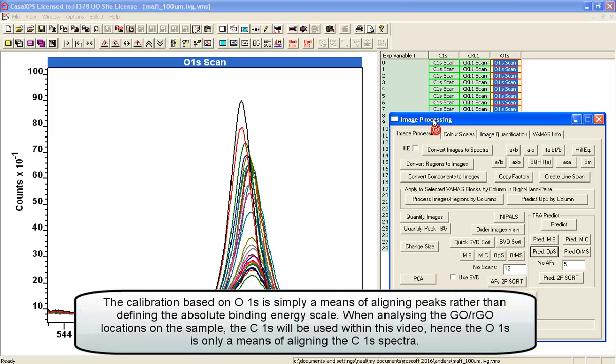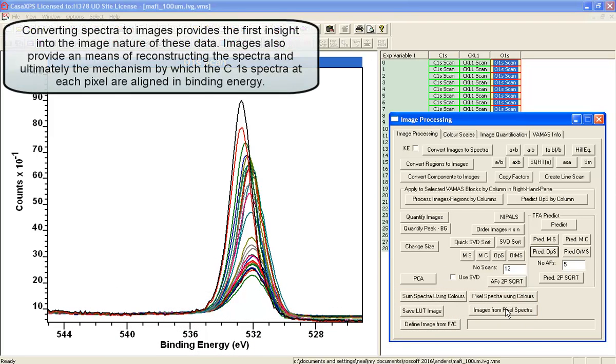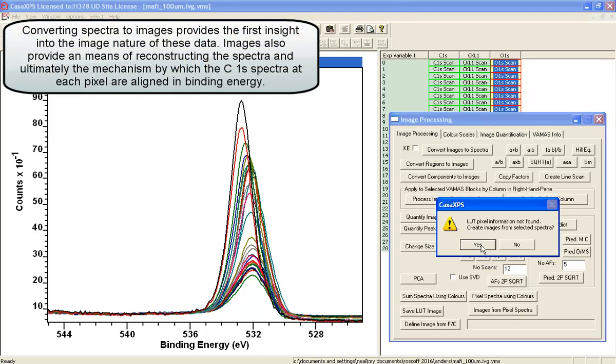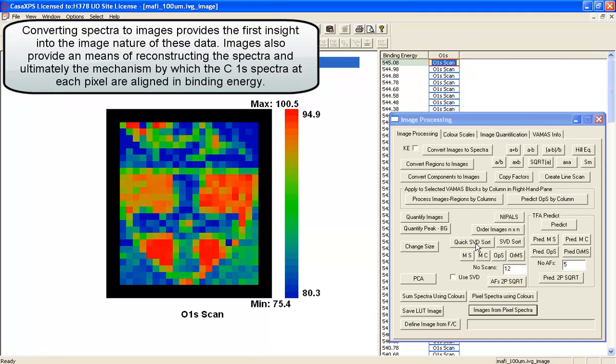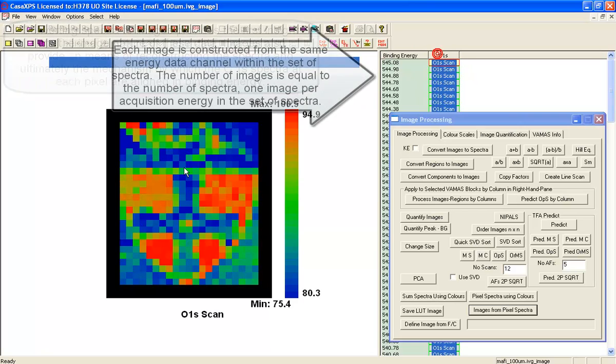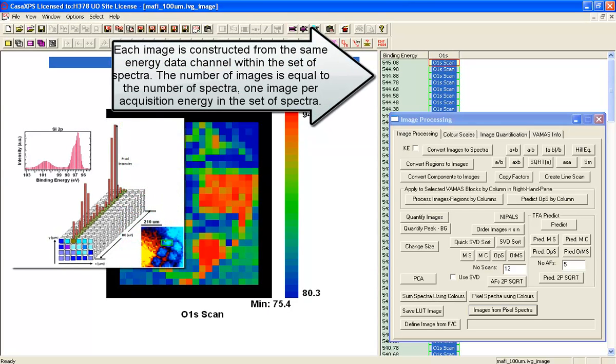The next step is to combine the oxygen and the carbon so that both can be calibrated at the same time. The way to do this is to create a set of images that represent these oxygen images that have had the noise reduction.